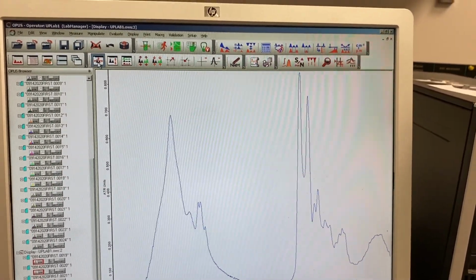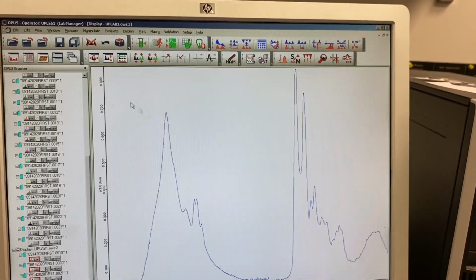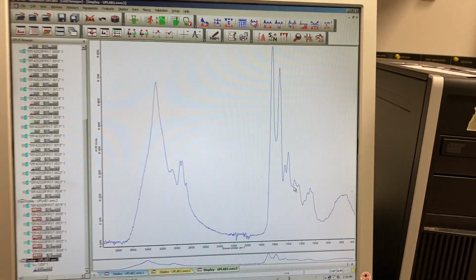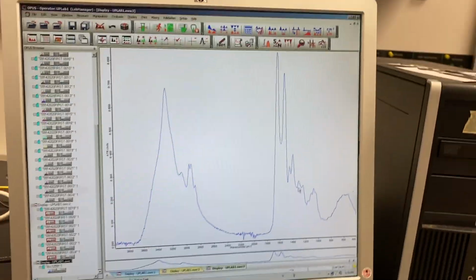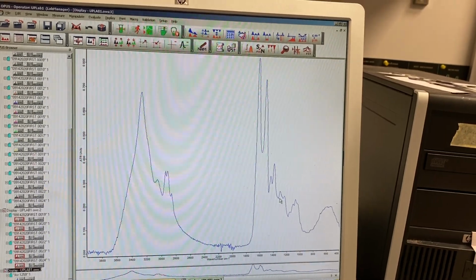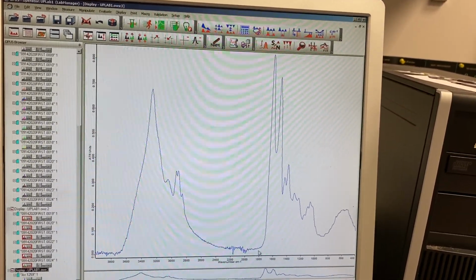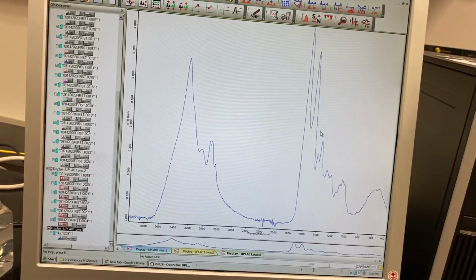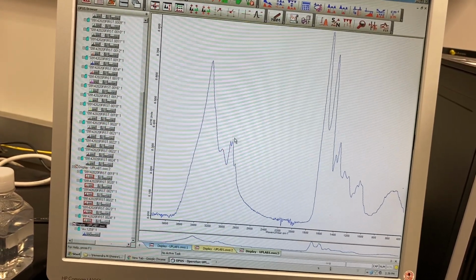You can magnify by this one. So I magnify this one. This is the magnified, so that you can see clearly. This is the average spectra. I will convert this into an Excel file and put it into the Excel folder, so that you can see the data with that spectral curve. So this is the original curve.